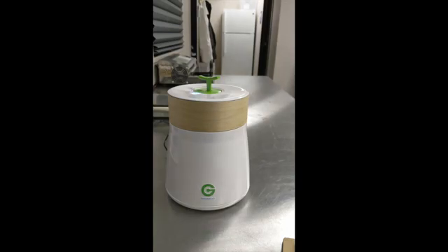One of the most useful things for this device is for CBD. When you're trying to breed a CBD strain that is either really high CBD, low THC, or a 50-50 blend, it's basically impossible to know what you're working with unless you are doing tests. Laboratory tests can be pretty expensive, and even if they're only $25 a piece — which is about as low as I've seen — it adds up quickly when you have a lot of them to do.